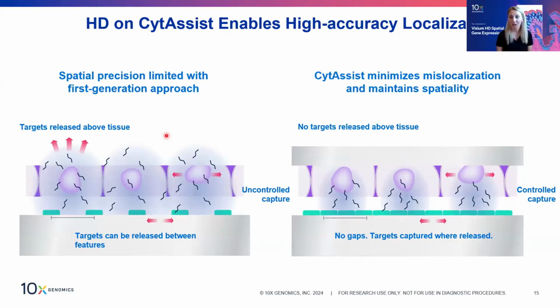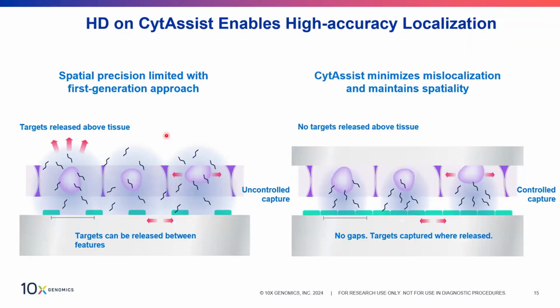And with the last question, there came another question. Can we get desired results from 14 micrometer thickness sections? Ooh, that's tricky. I wouldn't recommend using those. It depends on what tissue it is, but 14 seems way too thick, because then we don't really have control over how much the permeabilization and the RNA digestion works and how deep they go into the tissue in hybridization. So this is very unsupported, and I'm not sure we have even tested this. So this is definitely not recommended.